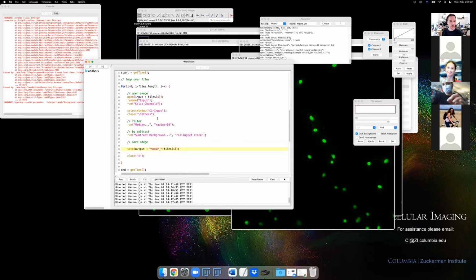Okay, and then we have to threshold that image. So after we've done this, we can say segmentation. In the end, the best one is actually to use auto threshold. So we're going to put the auto local threshold. Okay, so we're caught up to where we were. We have these cells now. Maybe we want to count how many cells there are.